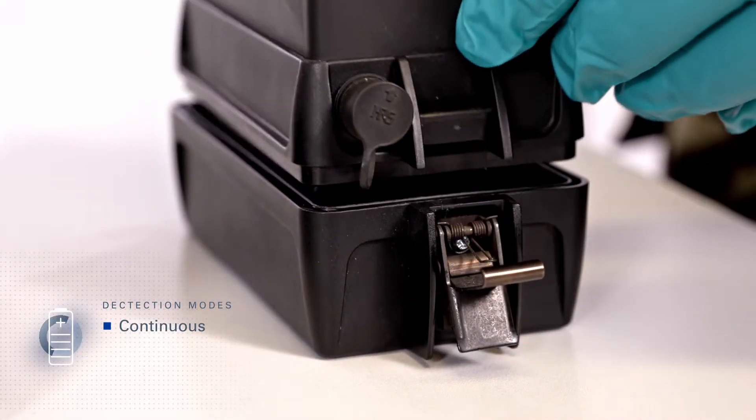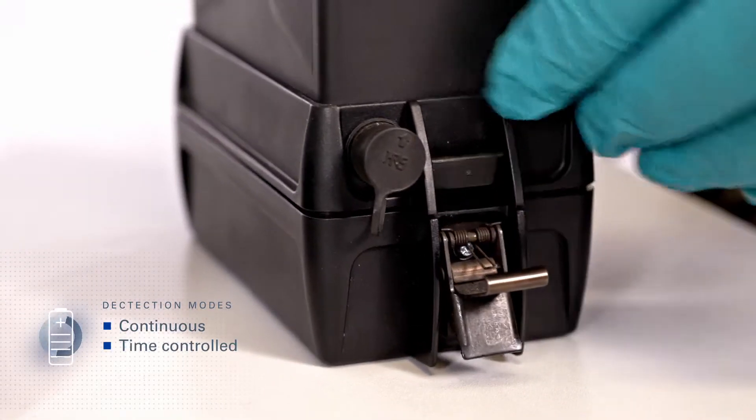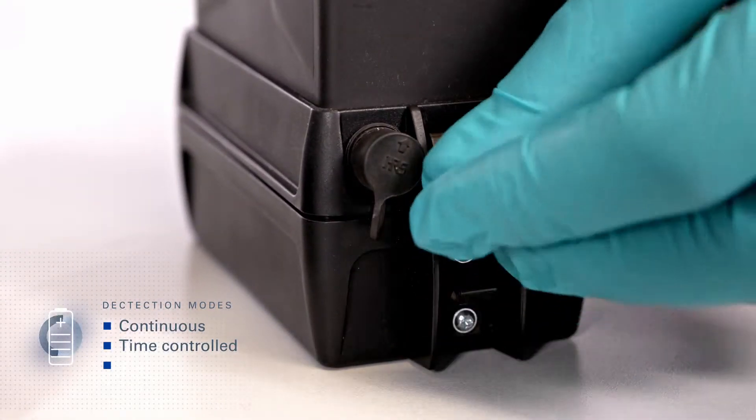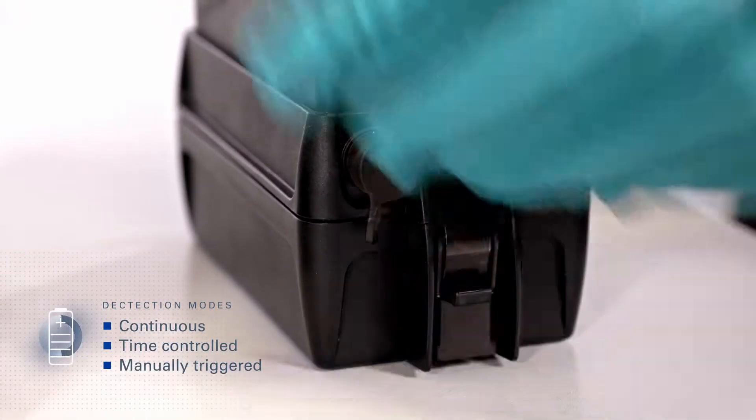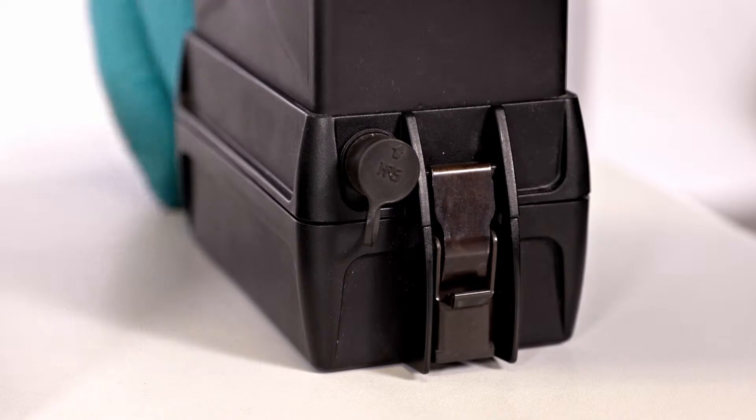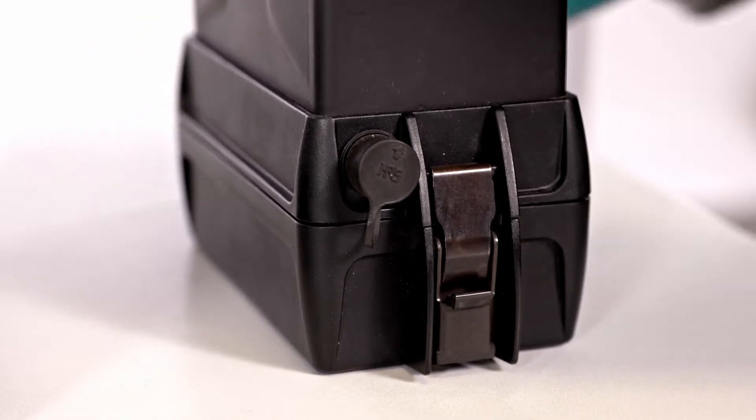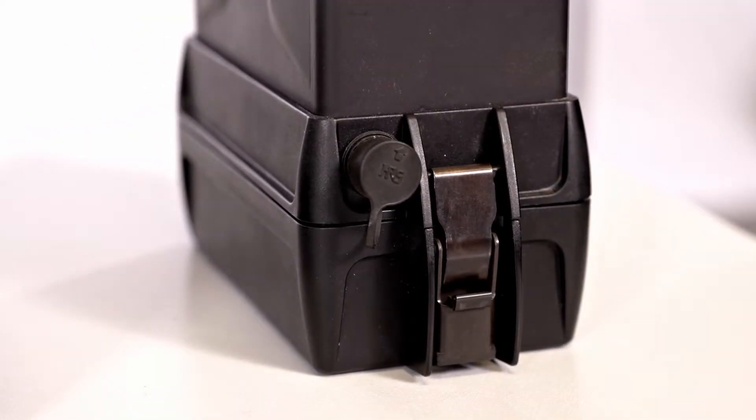Varying detection modes, continuous, time controlled, manually triggered, can be selected in order to increase battery life.